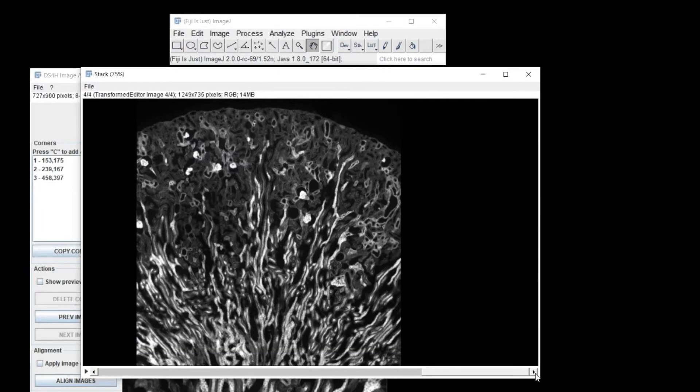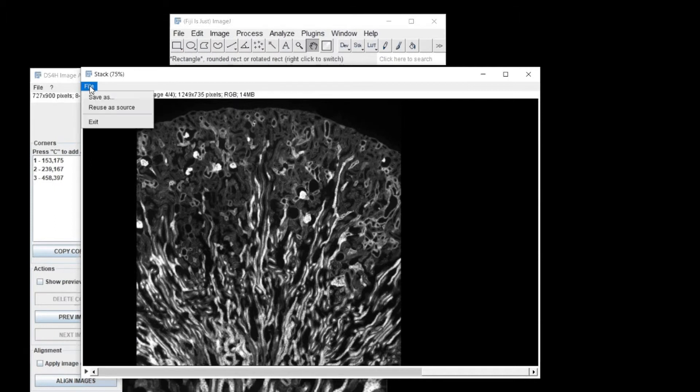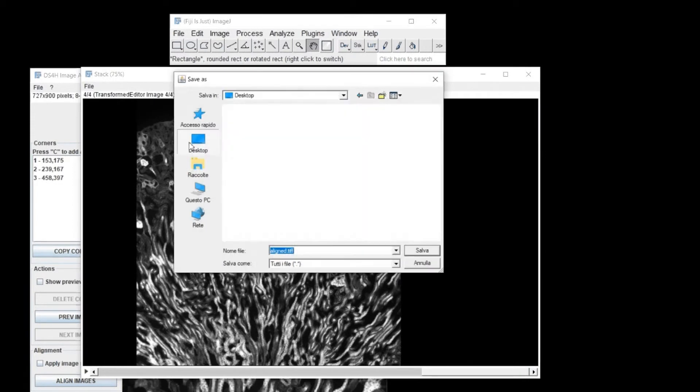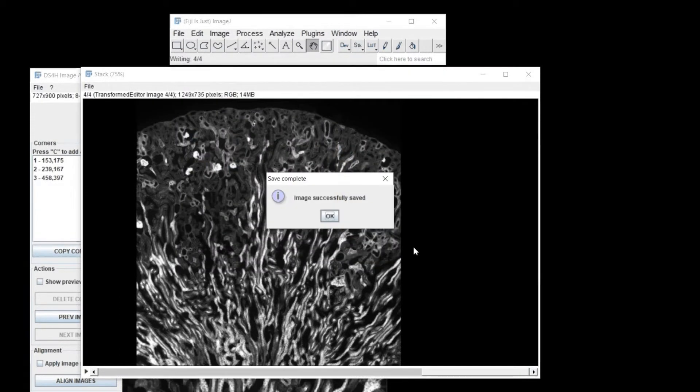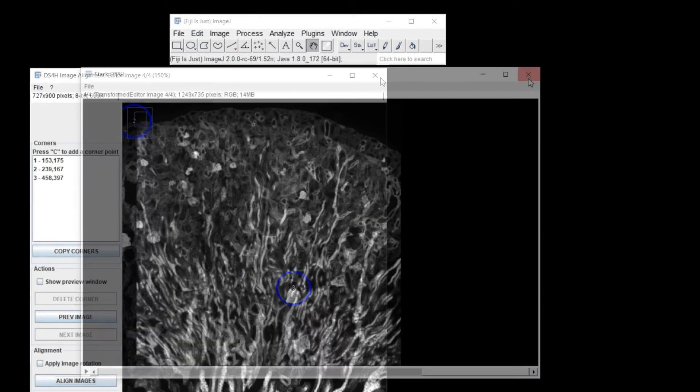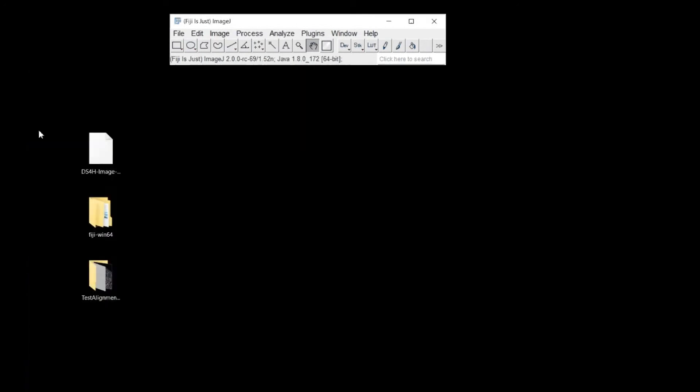Now you can load back the aligned images to improve the alignment by defining other corners and repeating the process. Once you are satisfied, just save the stack of aligned images.